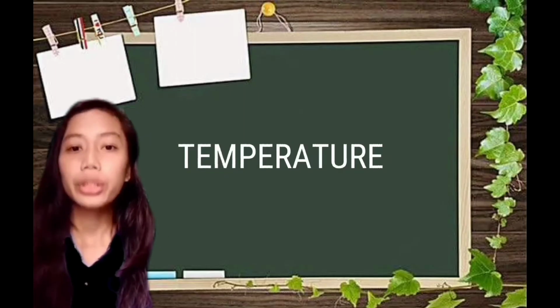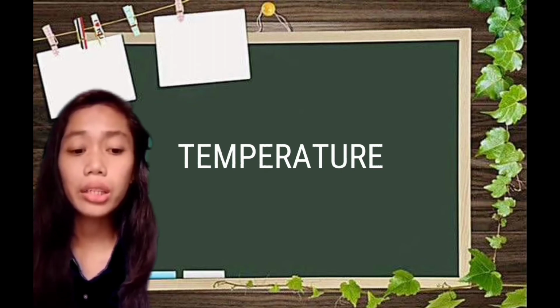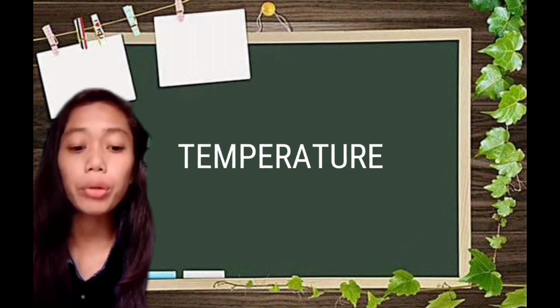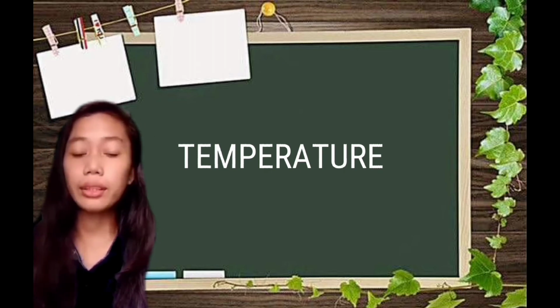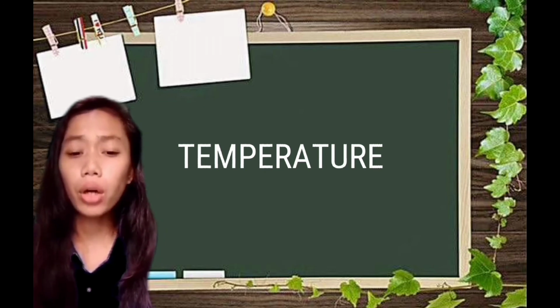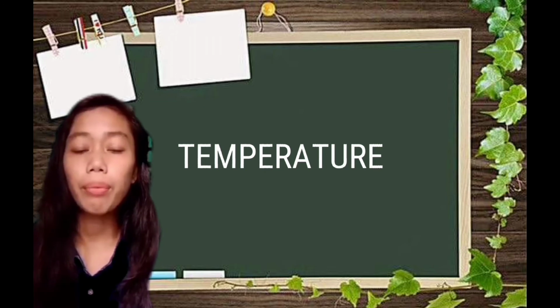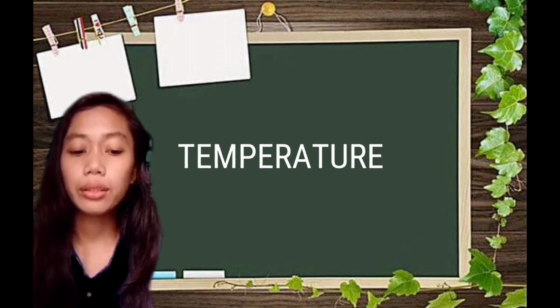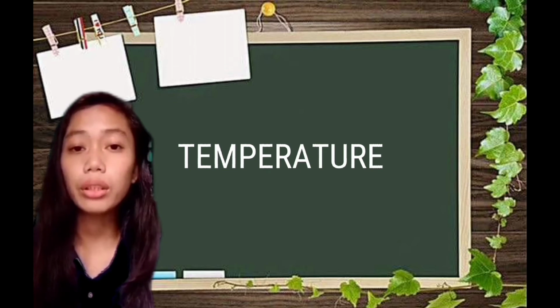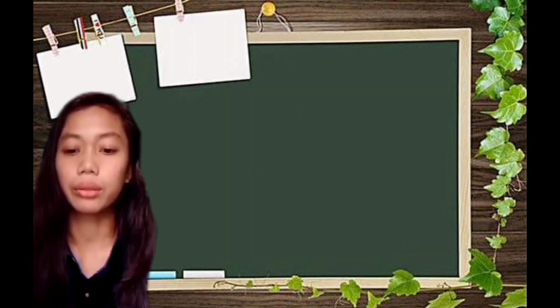Temperature: check the mean and max thermometer for any increase or decrease in the temperature of the algal culture facility over the past 24 hours. Most of the commonly cultured algal species cannot tolerate temperatures above 26 degrees Celsius. Temperatures in the range of 18 to 23 degrees Celsius are ideal for indoor culture.